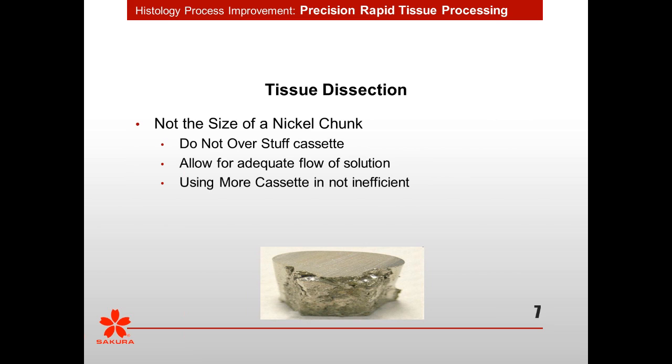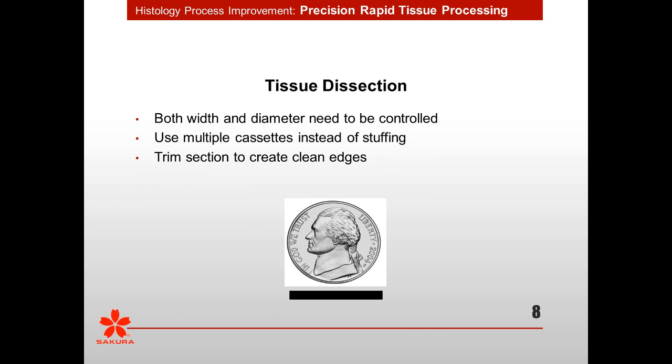Cutting something up and deciding that you only want a certain amount of tissue pieces in a particular cassette and then moving to the second cassette. Think of when you get to microtomy, if you jam all those pieces, all the time that somebody spends at microtomy making sure that they get the appropriate and highest quality section. If you move to maybe 2 cassettes or multiple pieces and split that up, they'll be able to cut those easily, more efficiently. So adding more cassettes is not always inefficient.